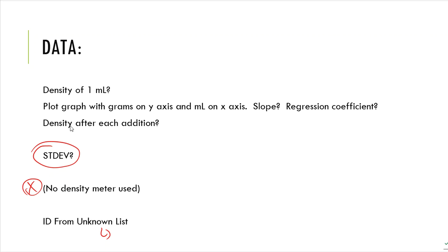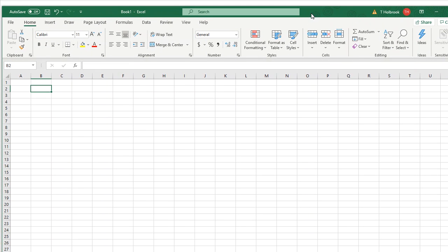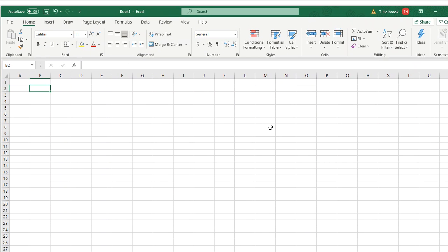Now I want to go back up and talk about this plot. The lab directions are going to tell you to make a plot, and folks, I'm not going to tell you to whip out graph paper. Graph paper's for elementary school. We don't need graph paper here. We've got something else that does that, and that's called Excel. So here is the Excel software, and as a student at Cape Fear, you have access to a free copy of Microsoft Excel if you don't have one.